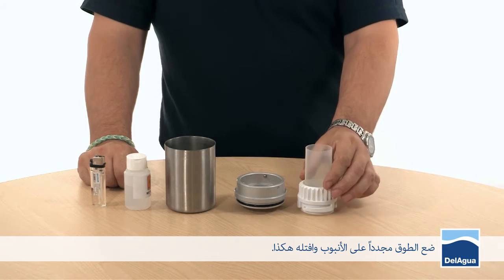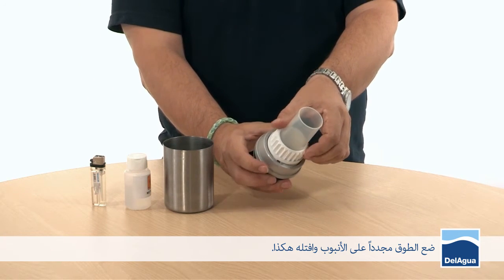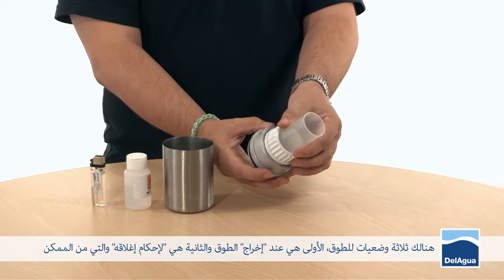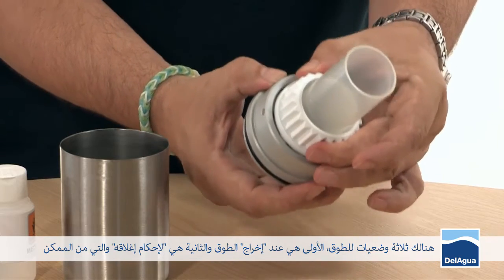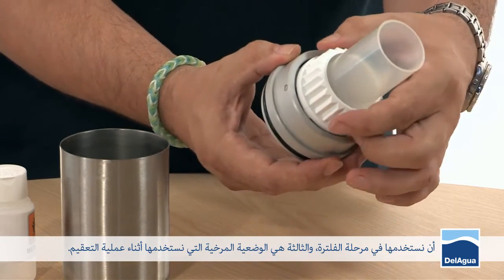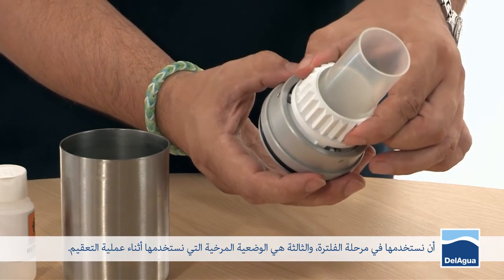Put the collar back on the funnel and insert like so. There are three settings on the collar. The first is off, the second is tight, which we use during the filtration step, and the third is loose, which we use during sterilization.